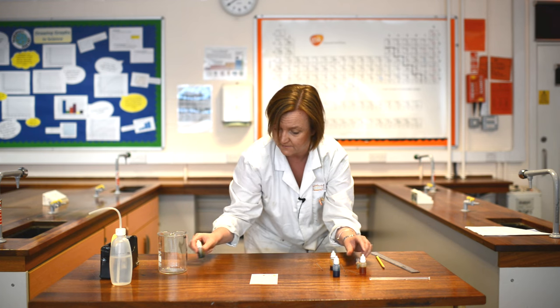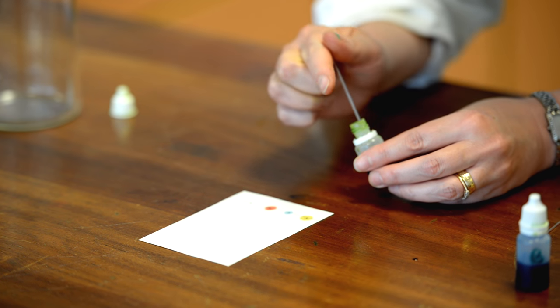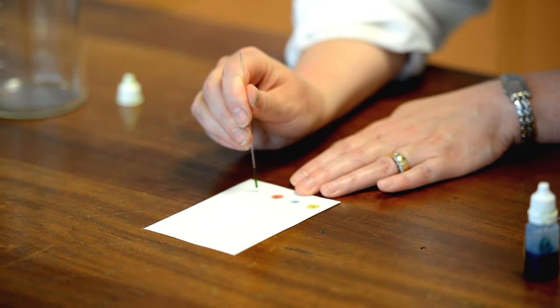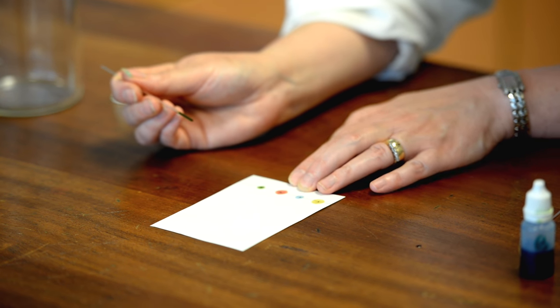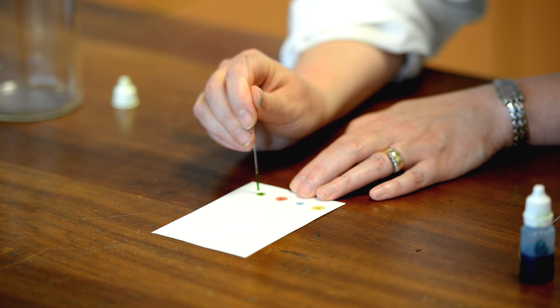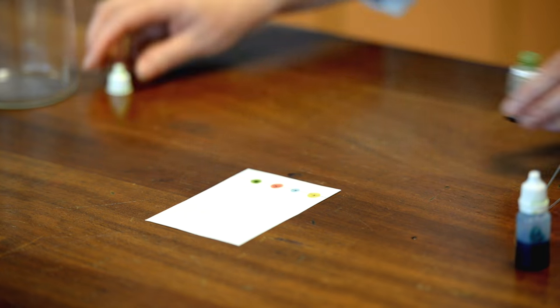And last of all I'm going to put my unknown coloring. This is green, so we can probably guess what colors are in it, but we will take this as our unknown. Dot it onto the final cross, again just do it once, twice, and then three times just to make sure we get plenty of the food dye on there.